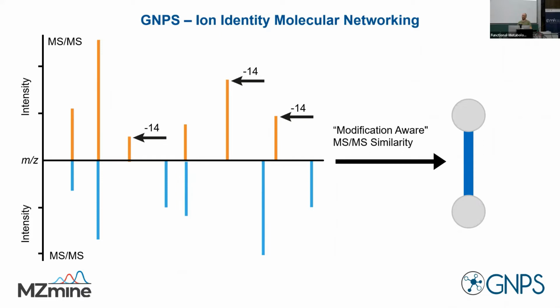So yeah. Okay. Was there another question? Okay. Awesome. Okay, one more. It's a simple detailed question. For MZmine, after I run, I try to save the project. I see there are two different versions, like one is simple and the other reference. What's the normal way to go?